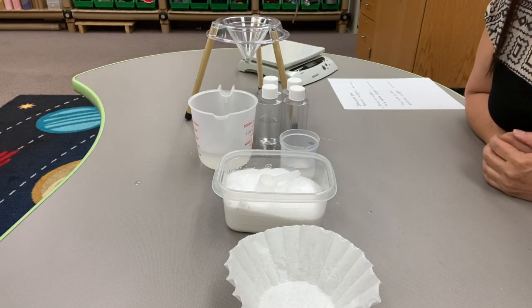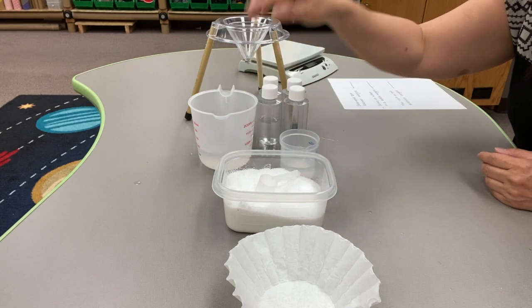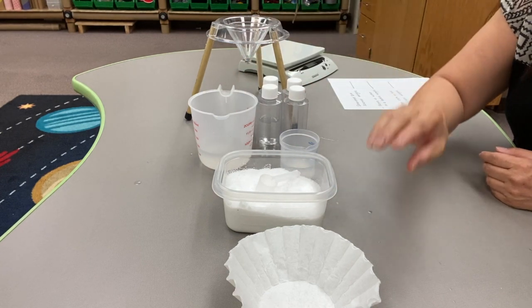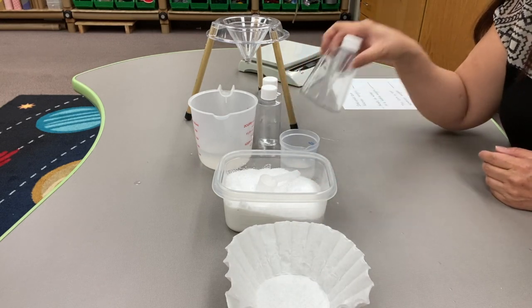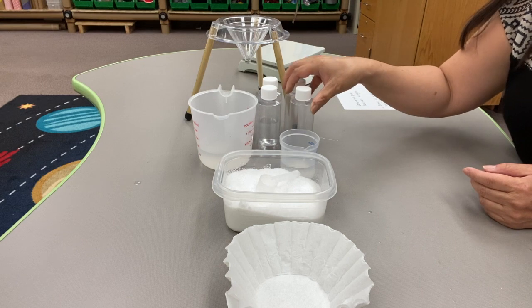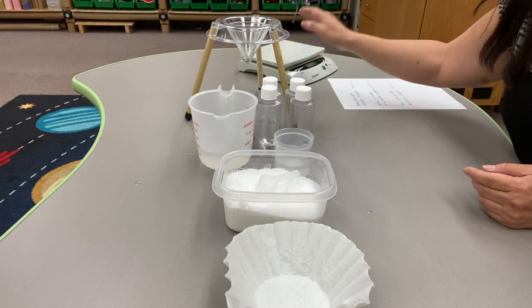For this investigation, we'll need some salt, some water, a funnel, some filter papers, some bottles to mix our solution, a cup for measuring water, and the scale.